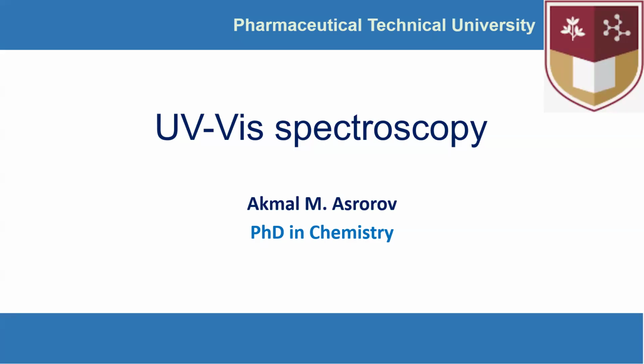Hello, today we'll talk about UV spectroscopy. This is another widely used method in different disciplines of research: bioorganic chemistry, biochemistry, pharmaceutics, and industrial chemistry. Today, this method is very efficiently used. Here we go.